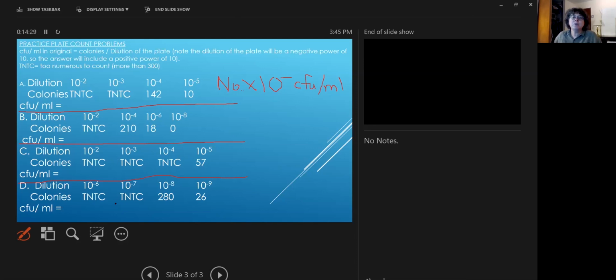And if you can do the plate count examples on this page, page 59, you will be able to do the plate count question we ask you on the lab exam. There will be 1 dilution series where you need to make calculations of the dilutions of the tubes. And then there will be a separate question where the dilutions will be given to you. The colony counts will be given to you just like here on page 59, but you have to do the calculation to come up with CFUs per milliliter.